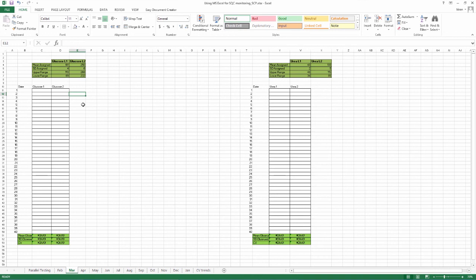The assigned values will stay the same as long as the lot lasts. The calculations of the observed mean, SD, CVs will still be available. However, re-graphing will need to be done as explained earlier.